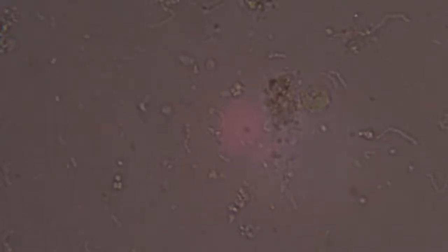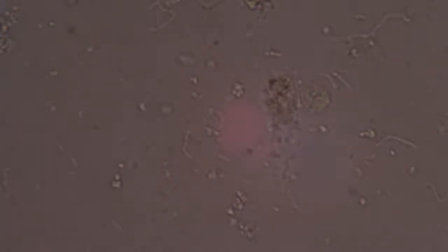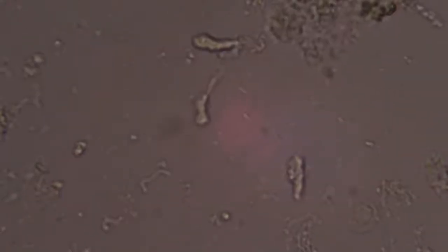Those could be... I mean... At this rate, they're coming out of my lungs. They could be portions of alveoli. Who knows at this point? You get some pretty violent coughs, you don't know what the hell is going to come out of you. But there are lots of them. Lots of little spherical guys here. Not your standard kind of blotchy cells. Nice spheres.